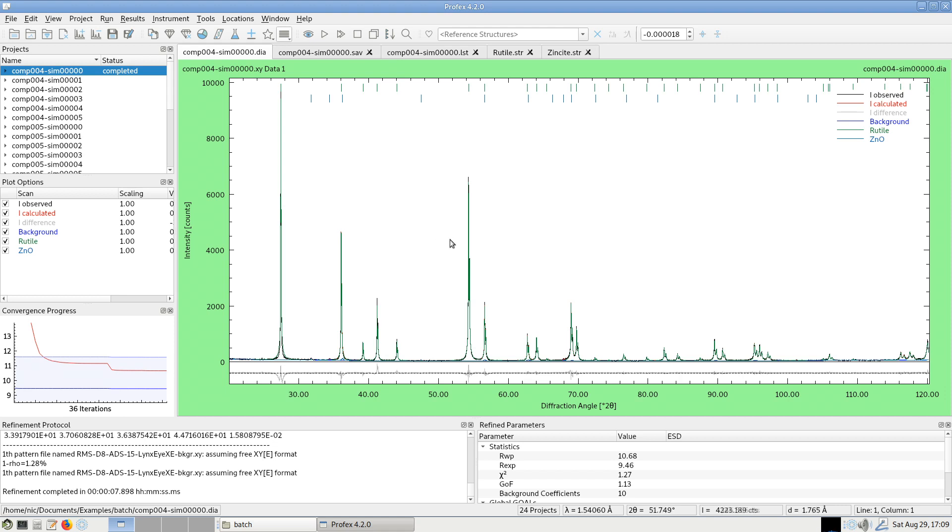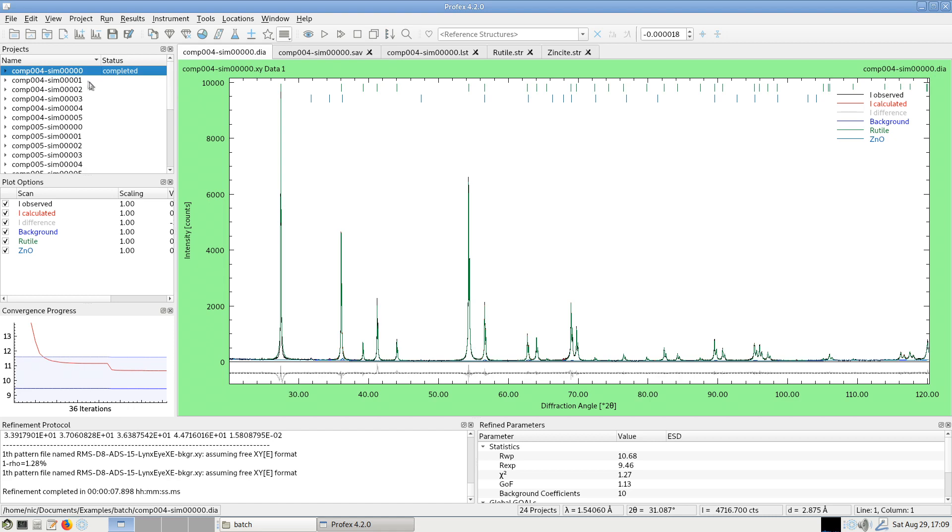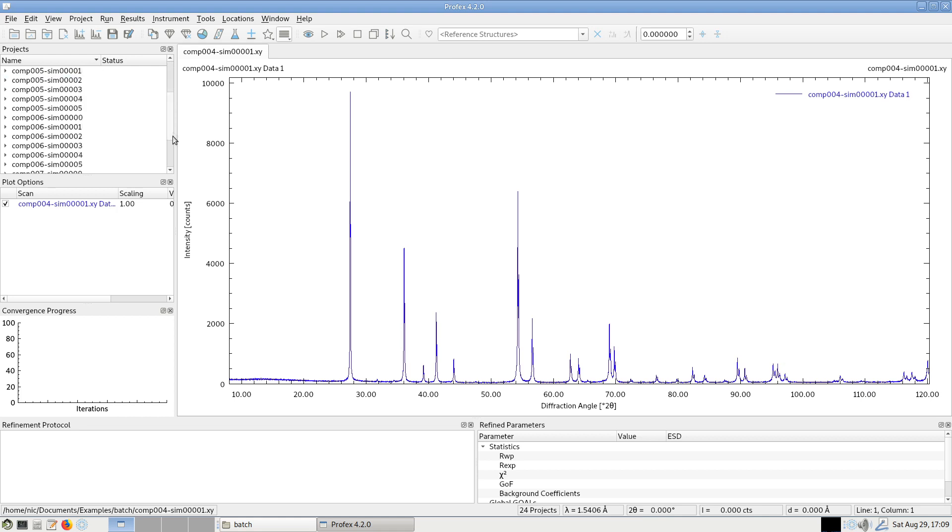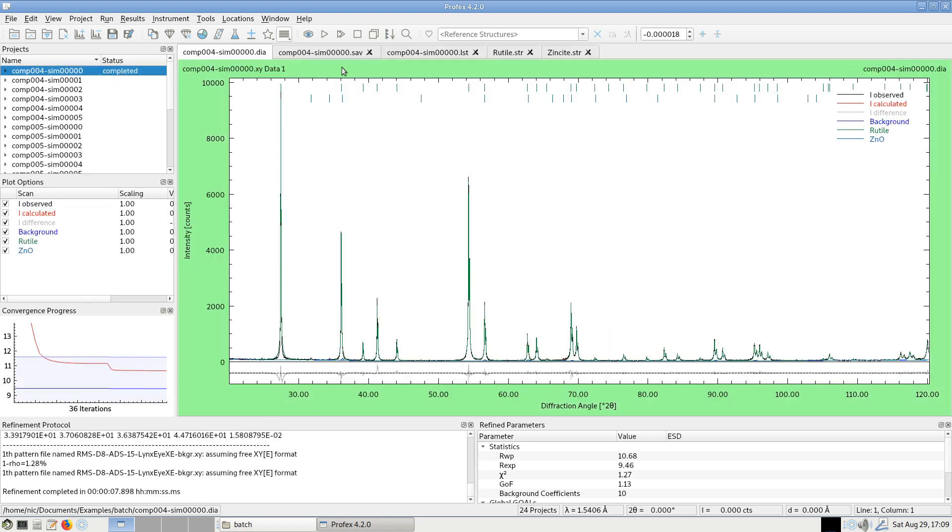Now I would like to use exactly the same refinement strategy for all of my other projects, because it's the same phases, just mixed in slightly different ratios. But instead of having to create a refinement project, applying the same tweaks to the structure files and to the strategy, this would be a lot of work, doing it another 23 times. And it's not necessary. I can simply apply the strategy, the control file and the structure files I created here, in the first project, to all other open projects.